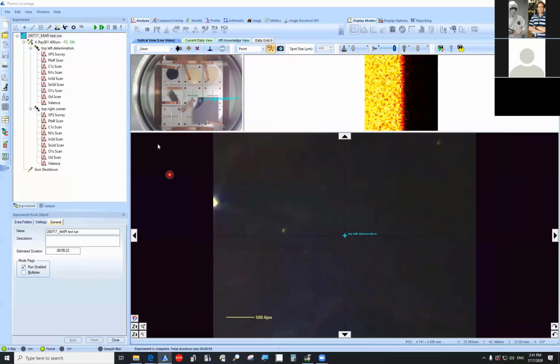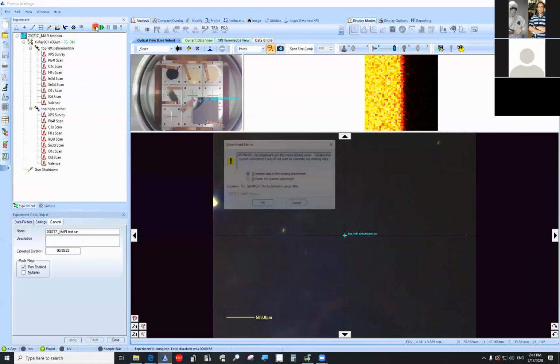Okay, so if there are no further questions, complaints, suggestions, or other commentary, I'm going to go ahead and start this. So we go up to our experiment. Just one more time, make sure this is saved. And then we're going to execute the full experiment this time. So I'm going to click on the experiment run button. At the end, it will shut down my guns, and that will leave the tool in a stable state to be able to walk off. So here we go, run button.